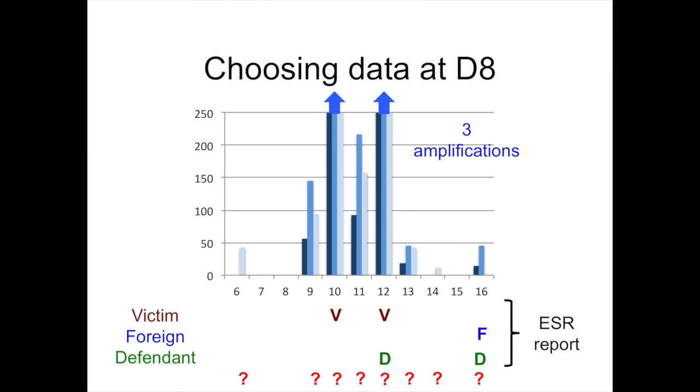These are some examples of how data are chosen. These are different alleles. This is data. The arrows mean that those peaks go up about 10 times taller. The different blue colors are 3 different experiments that were analyzed together in STRmix. And you see there's a lot of data here. There's a lot of blue bars. Here's a threshold of 50, 100, and so on. Those are the different RFU levels that could be set. 50 was used. This is a visual representation of what was in one of the STRmix reports.